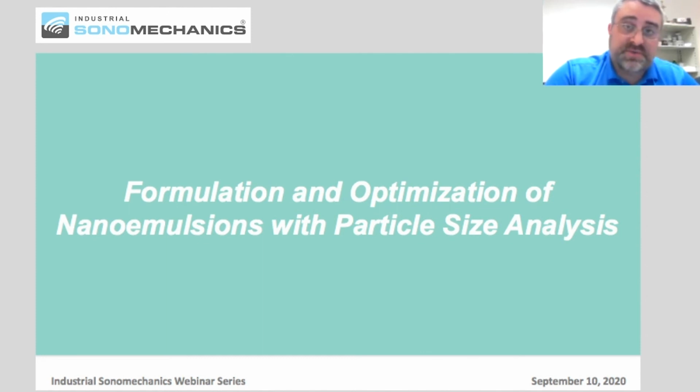However, when you get into those lower limits of laser diffraction, you'll start to lose resolution. You won't be able to pick out size peaks as easily as I showed you in the polymer sample for laser diffraction. At the same time, for dynamic light scattering, as you start increasing in size, you start to have gravity competing with Brownian motion, pulling on the particles. So you have sedimentation as well as Brownian motion. When you start getting to the limits of dynamic light scattering on the higher end, the operating principle starts to fall apart a little bit, and the data may not be very well repeatable.